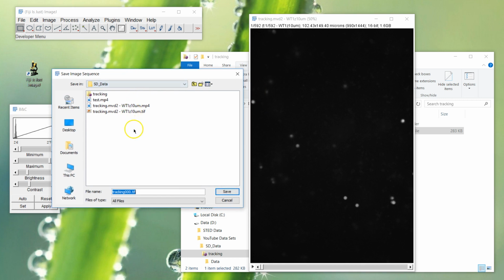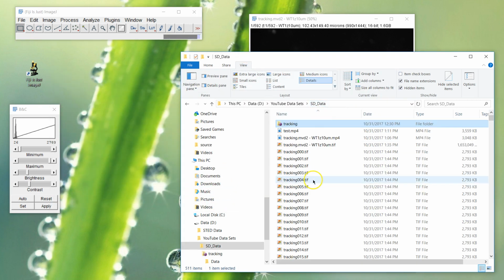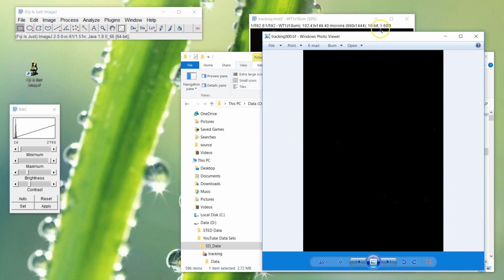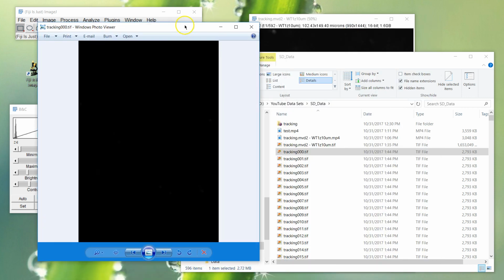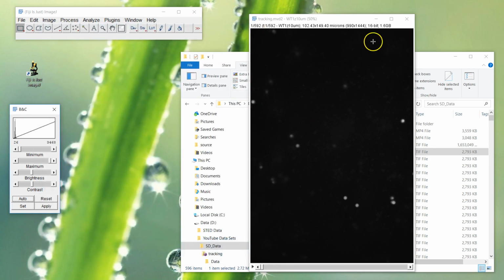This save dialog remembers where I was, and so it will put in the name here with 3 trailing zeros. And you go ahead and hit save, and it will just create a ton of those, and you will have a bunch of TIFFs, hundreds of TIFFs with raw data that you can analyze. And if you open it with a photo viewer, you won't see the data. Windows thinks it's 16-bit, and the values are probably only somewhere near 2000. Just look at the brightness and contrast, yeah, a few thousand. So it's just not contrast adjusted to see it, and keep that in mind.